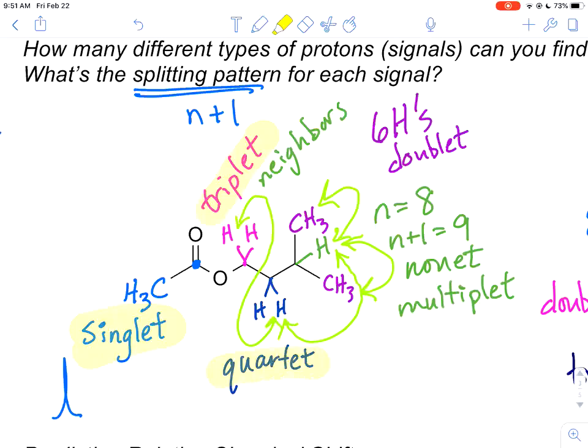which was distinct from this other CH2 quartet. Then we had a non-net, which is going to turn out to be a multiplet, just like a lot of peaks for the green team, that CH signal. Then finally, a doublet for the six hydrogens of these two methyl groups.